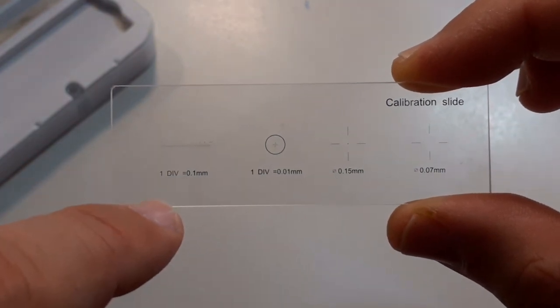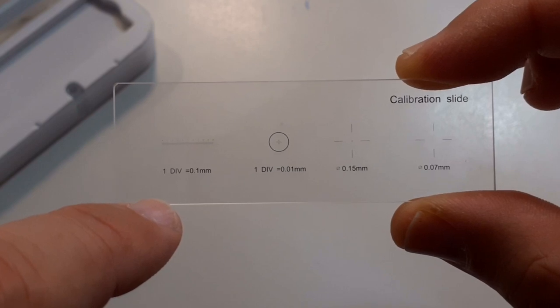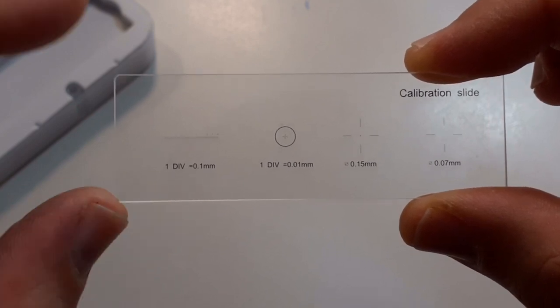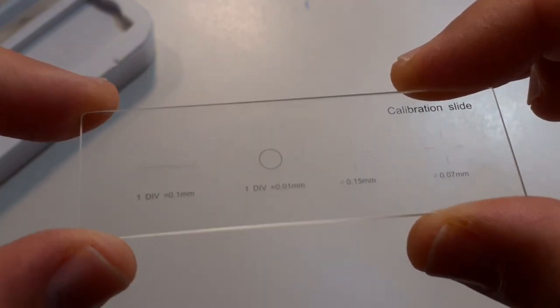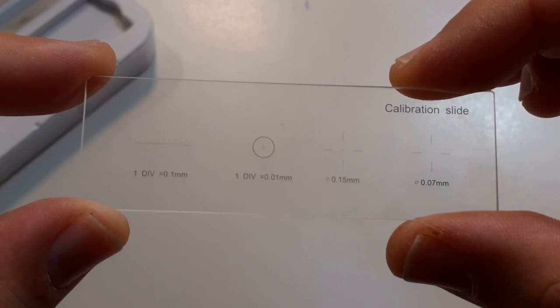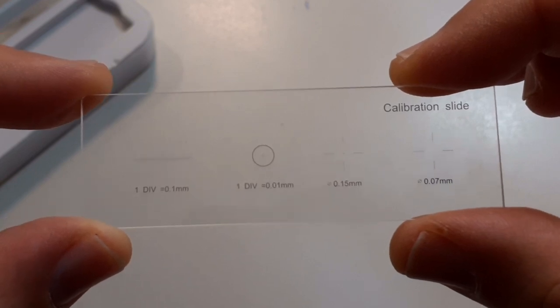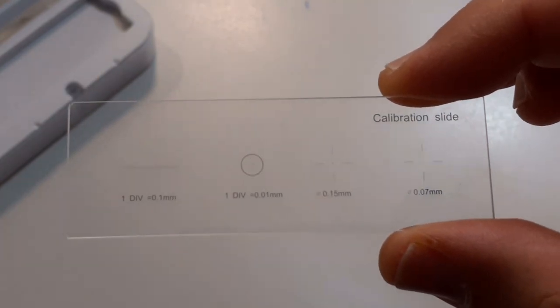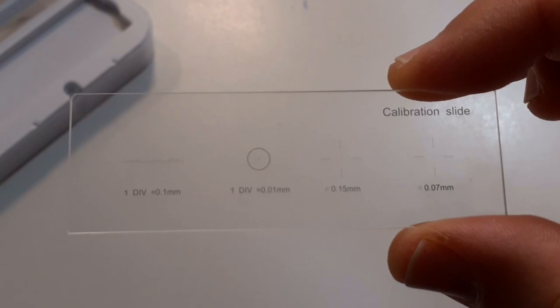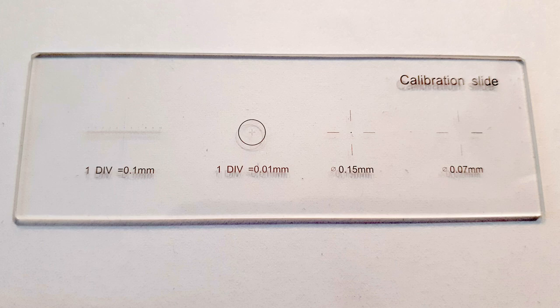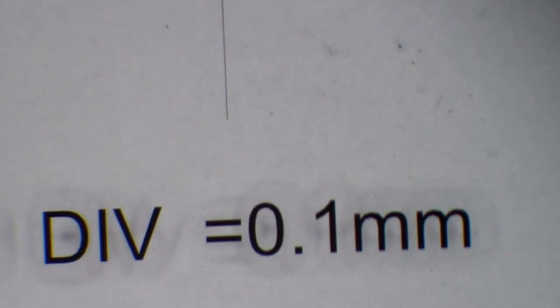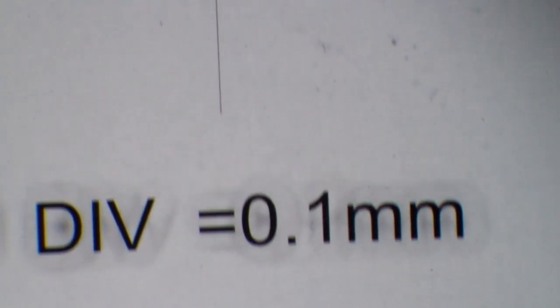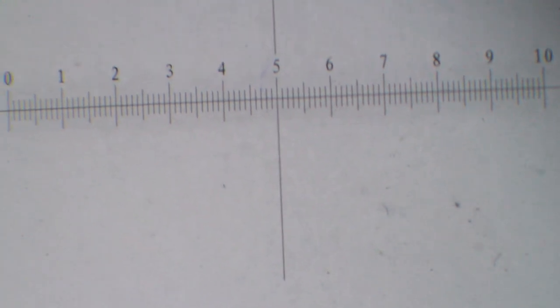Now, I have to admit, I do not quite know what they are used for. So if you have any idea, please write a comment. I'm talking about the dots now. I'll be using the engravings on the very left, which has a dimension of 0.1 mm. So I'll put the slide under my stereomicroscope, and let's have a look at it a little bit closer here.